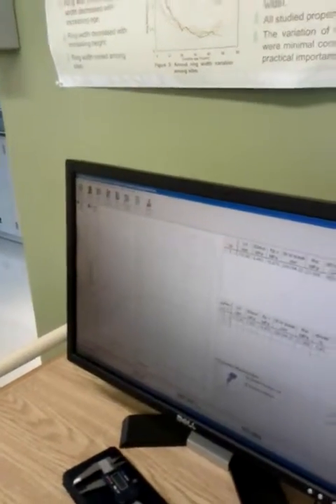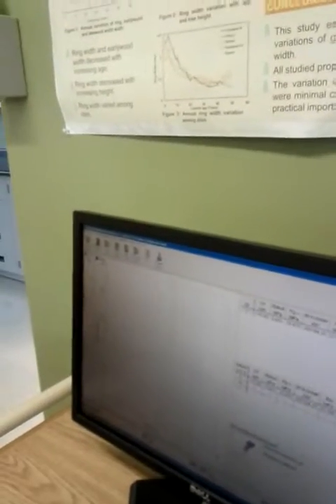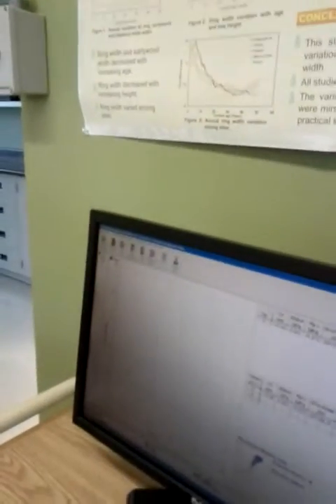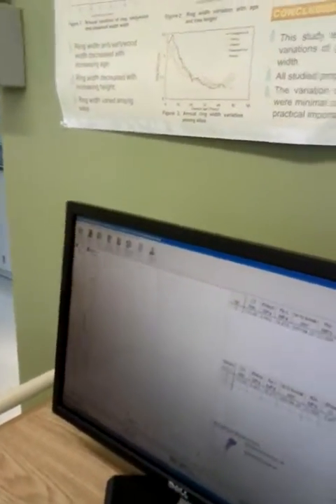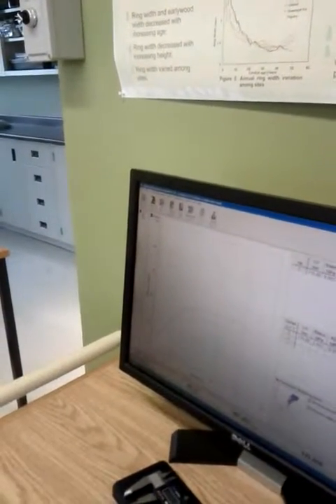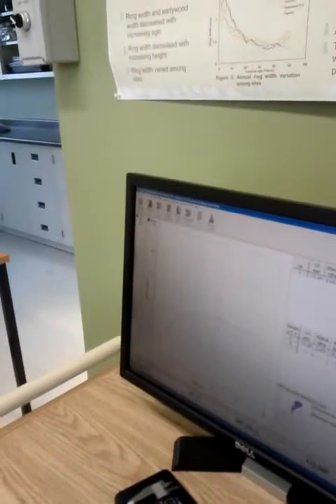So I want to try to understand. What we are using is basically 50-70% plastic material. So when we have a more linear part, it means the effect of our additional wood is more predominant or not. This is what I try to understand. It really depends. Usually with pure plastic, you have no linear part at all. Yeah, exactly, because it's plastic. So it depends.